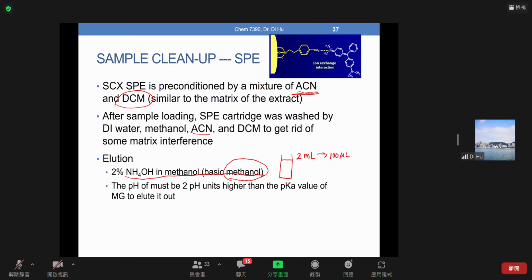We normally have a tube with a conical shape at the bottom, and the pure nitrogen gas blows in, and here it is heated.